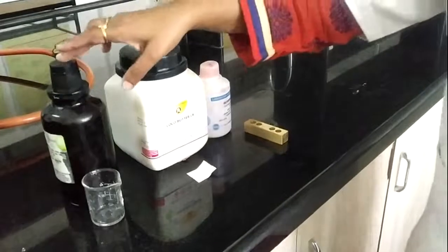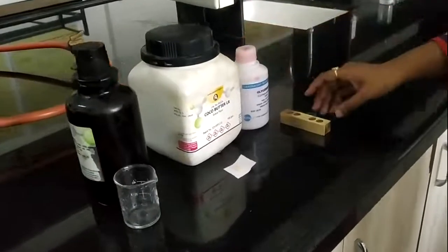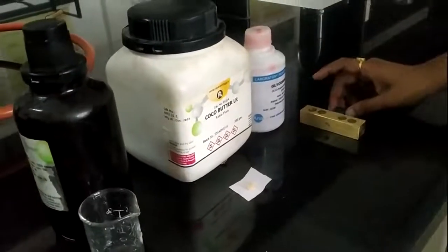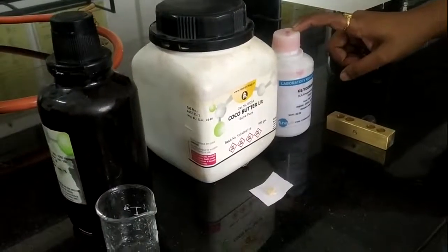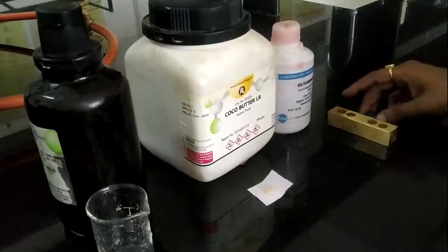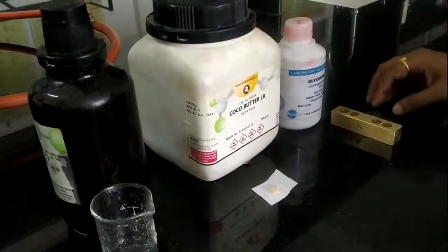So we have chloral hydrate, this is cocoa butter, and this is glycerin. This glycerin is used for lubricating the suppository mold, as I previously lubricated this mold with the help of glycerin. Anyone can use alcohol, 95% alcohol, or soft soap for lubricating the mold. In these suppositories the cocoa butter is used as a suppository base, so that particular lubricating agent is used, but I am using glycerin here.